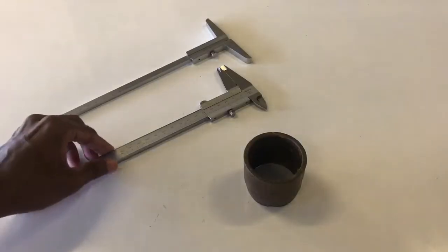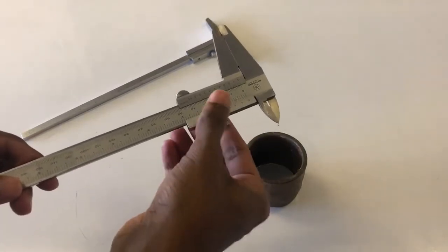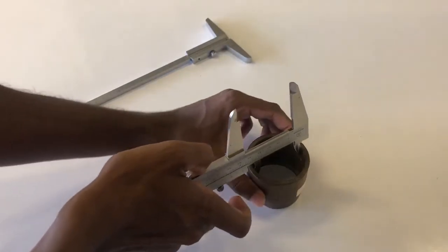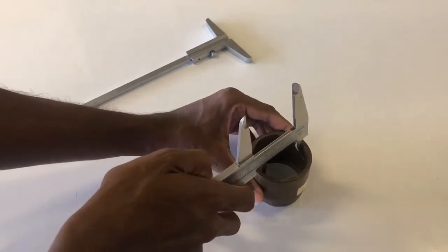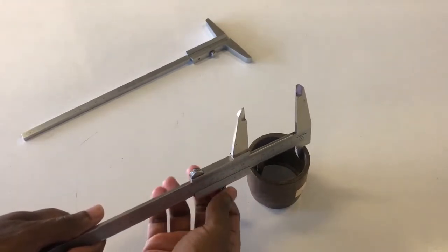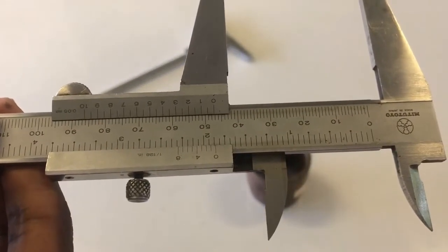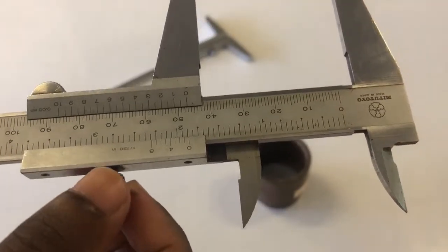First, we are going to measure the diameter. Screw out the equipment. Now it is movable. To ensure the diameter value obtained, you have to rotate at once. Now it is rotatable. Screw in. Remove from the device and observe the zero coincide with 50 millimeter. So the diameter is 5 centimeter.